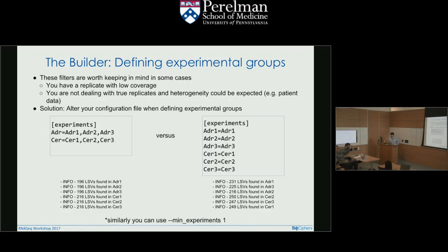We didn't want to report junk and say, oh, there's complexity, and then somebody goes and says, hey, those are artifacts. So we set a very conservative threshold. If you have 6 or 8 replicates, we want 51%, at least half of them, to be reliably detected in order to say, oh, this is real, I'm going to include it in my genome-wide view.